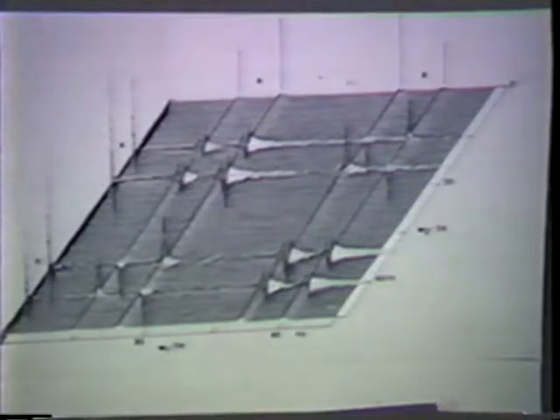But what I would like you to remember at the moment is that the cross peaks have about the same intensity as the diagonal peaks. Okay. But suppose I started reducing this coupling constant, or these lines were broad for some reason, then these will start overlapping and cancel each other. In such circumstances, the diagonals are big and the cross peaks are small. And that's one of the problems of COSY.